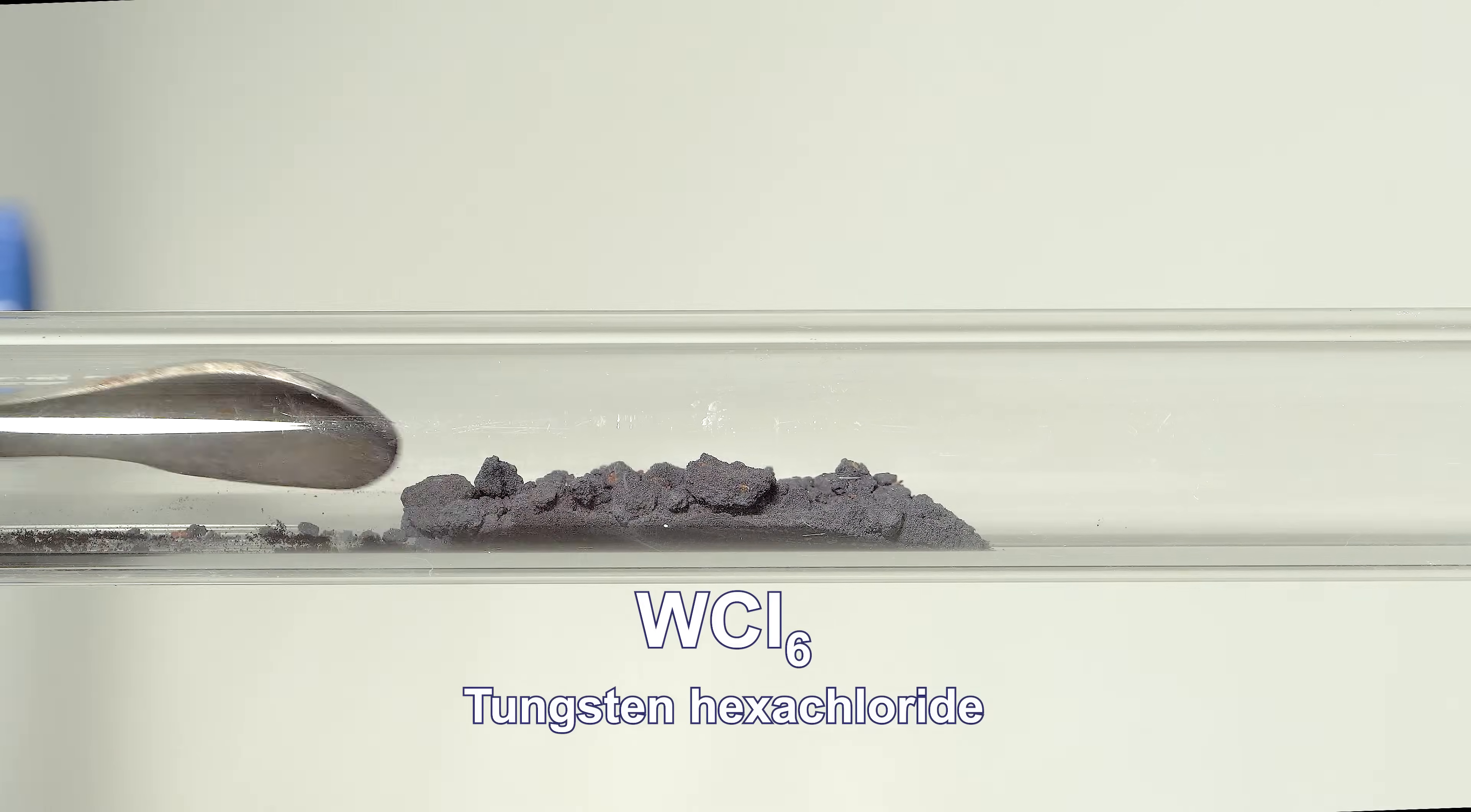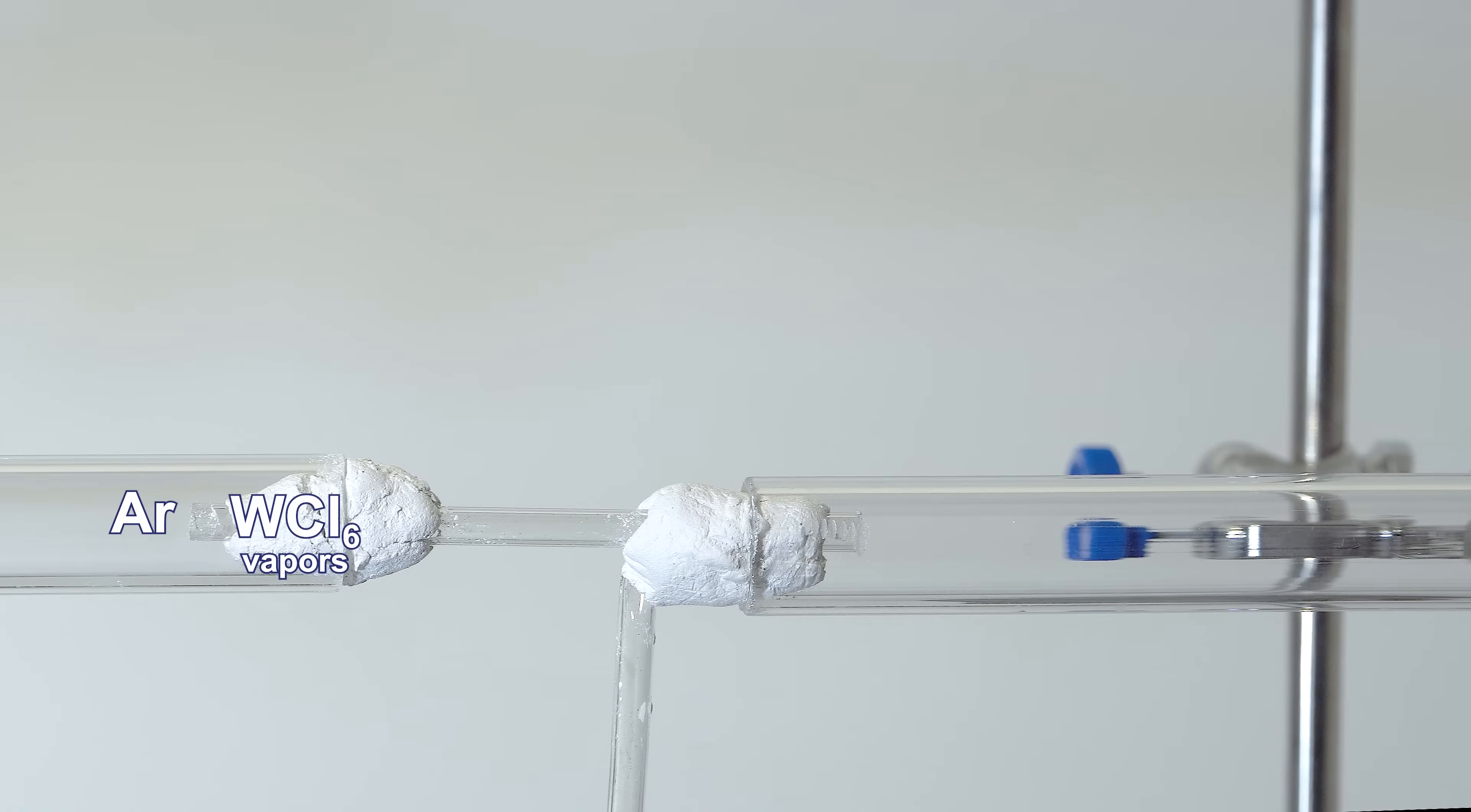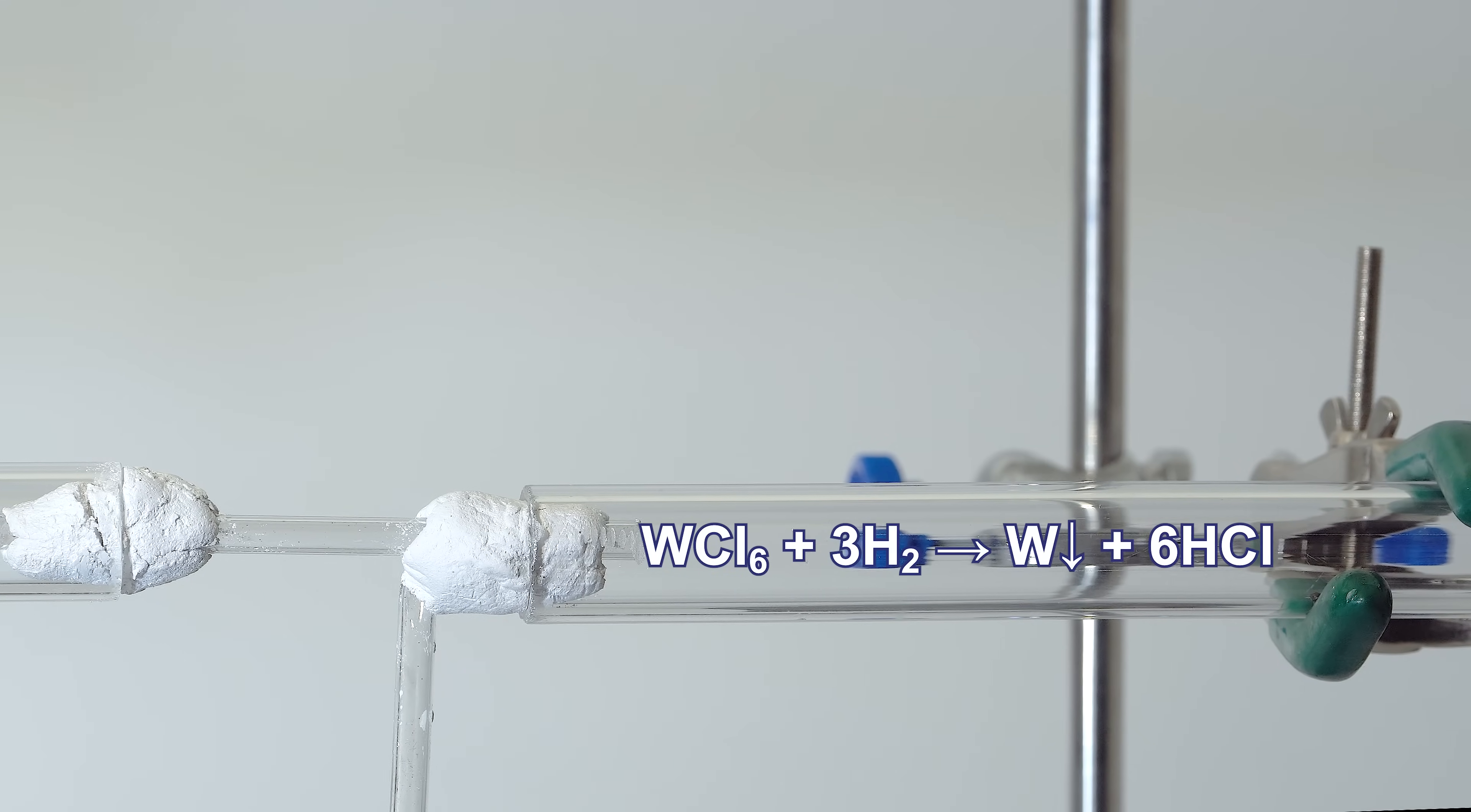I'll heat the tungsten hexachloride in the left tube connected to the argon supply. The argon will transport the resulting tungsten hexachloride vapor into the right tube connected to the hydrogen supply. The right tube needs to be heated vigorously with a gas burner, as this reaction demands temperatures exceeding 500 degrees Celsius.